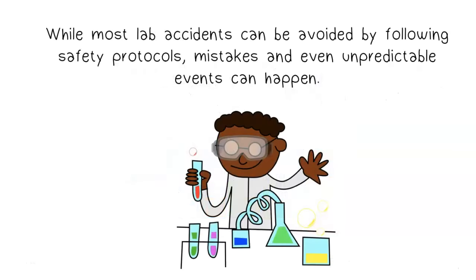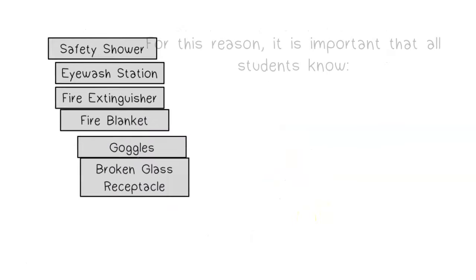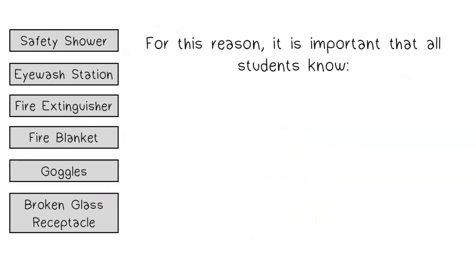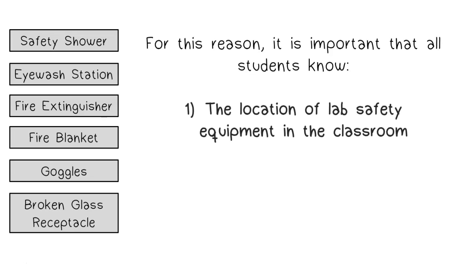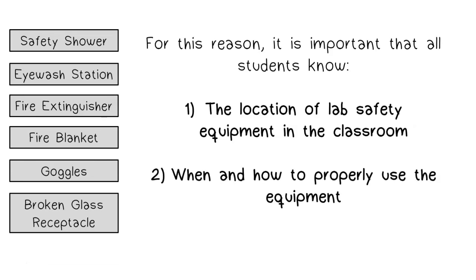While most lab accidents can be avoided by following safety protocols, mistakes and even unpredictable events can happen. For this reason, it is important that all students know: one, the location of lab safety equipment in the classroom; two, when and how to properly use the equipment.